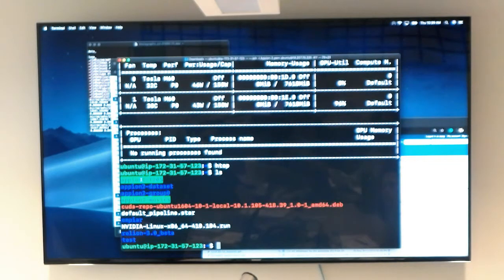If you have a very, very good image, you can actually go sub 3. But we also have the Appion 2 dataset. This is the dataset we'll be using today. If all else fails, we have the Appion 2 group 0 folder, and that's where I basically did the processing that we'll be going through today.